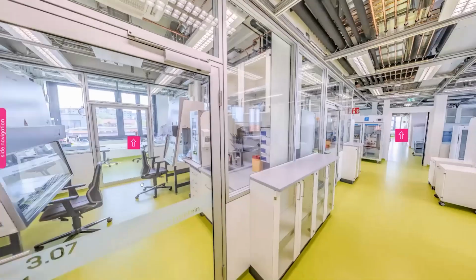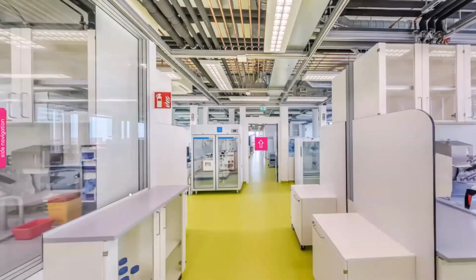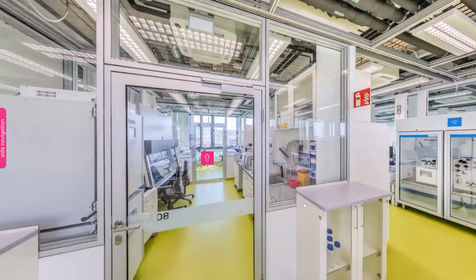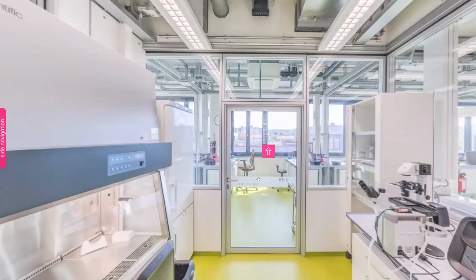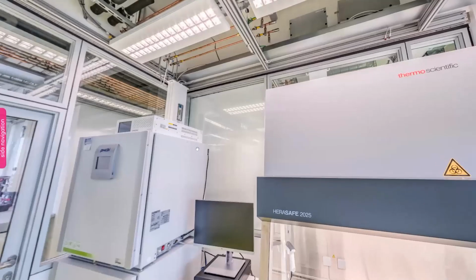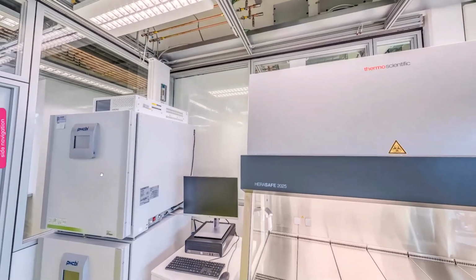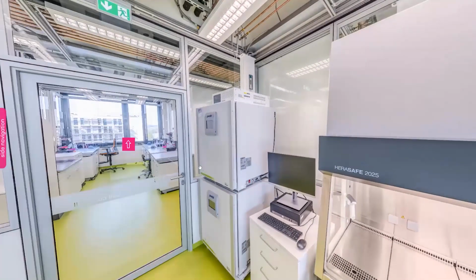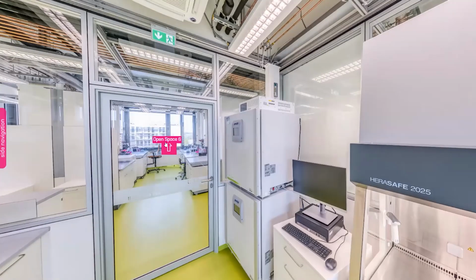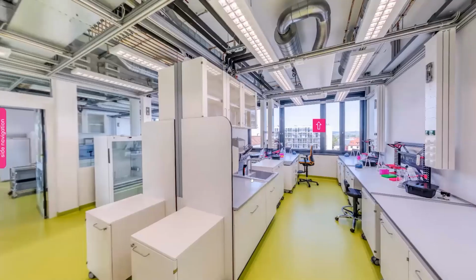Now you see here laminar flows, again, a second cell culture here. This one also, talking about equipment, we are able to provide an incubator site. You see the one unit up here in the incubator. So a real time live imaging system for the incubator, really quite a nice piece of equipment, which usually startups don't really have access to.